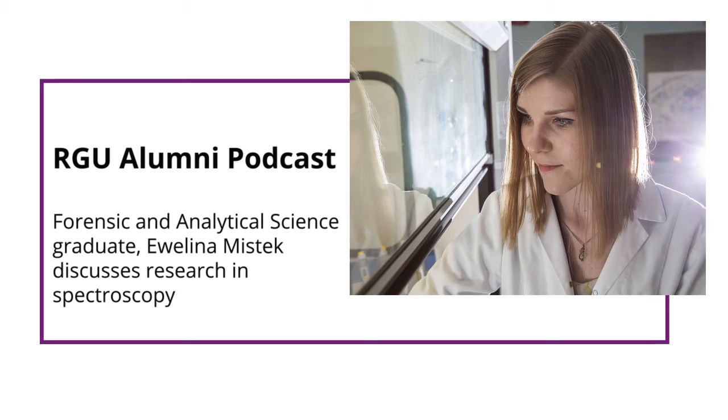Right. So you describe in your study the array of samples that can be analyzed with Raman spectroscopy. You mentioned substances like nail polish. It can be hair, blood, or drugs. So how is it that this technique works on so many different types of trace evidence? Since this technique is very specific, due to the unique spectrum which is created based on the chemical or biochemical composition of the sample, the signatures will be very unique.